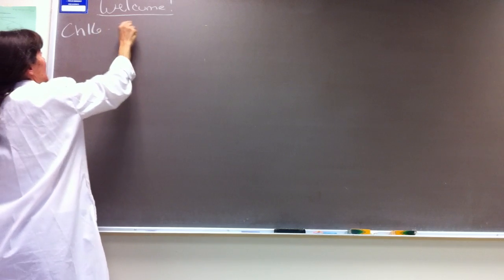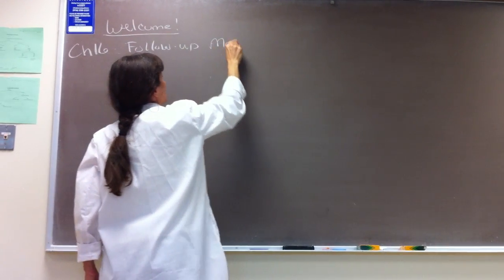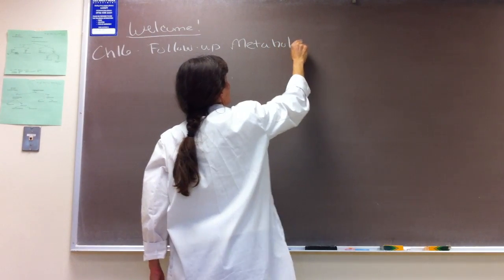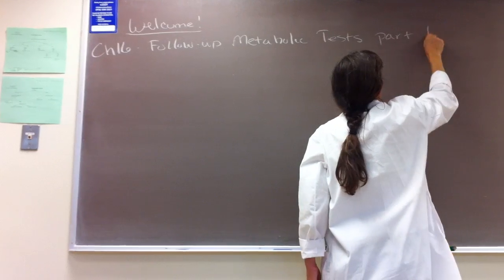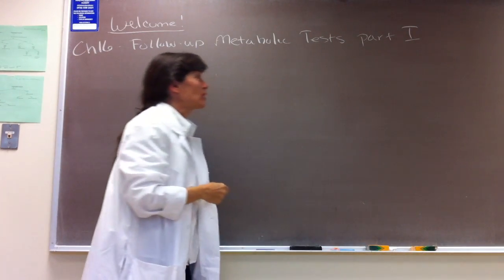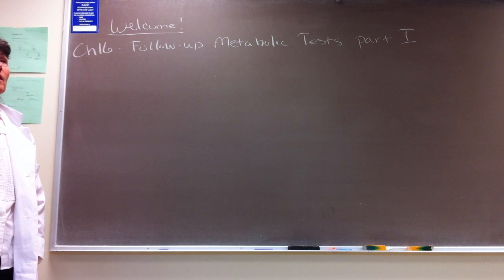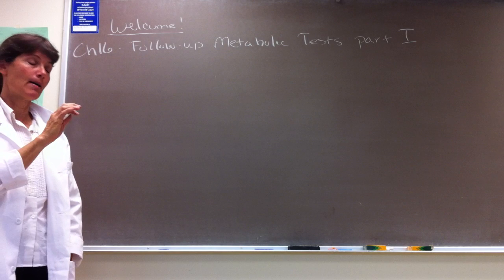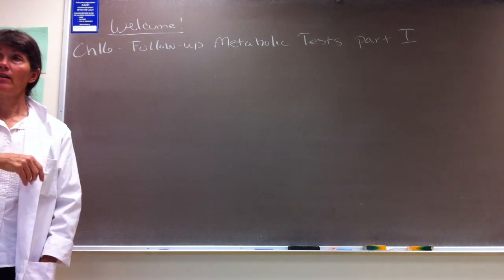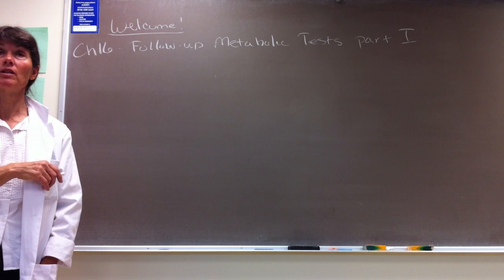Chapter 16 follow-up, that's Metabolic 1. And what we'll do is record our results. I'm going to ask you all to have one person per team come up and record your results, and that will help drive a class discussion. And then we'll describe the Chapter 17 Metabolic Test Part 2 that will be inoculated today.